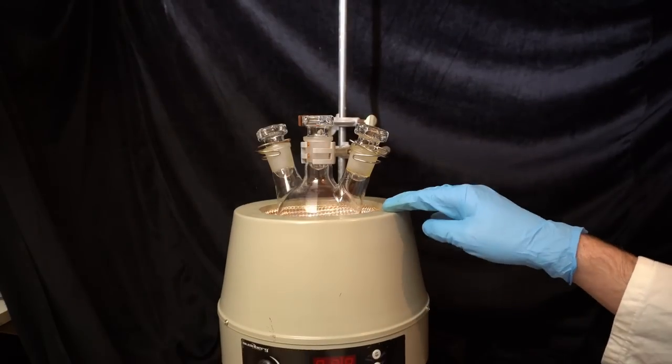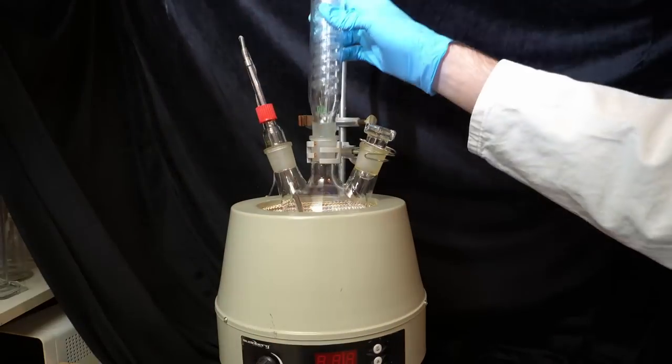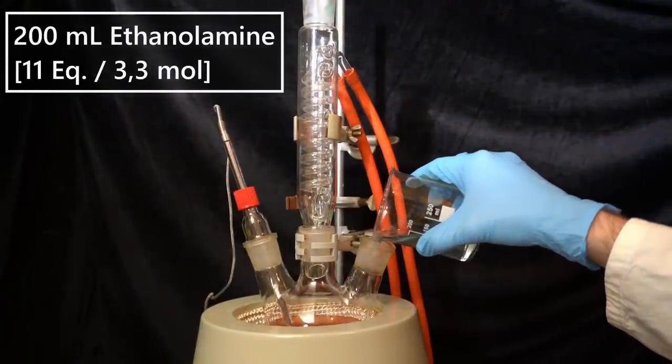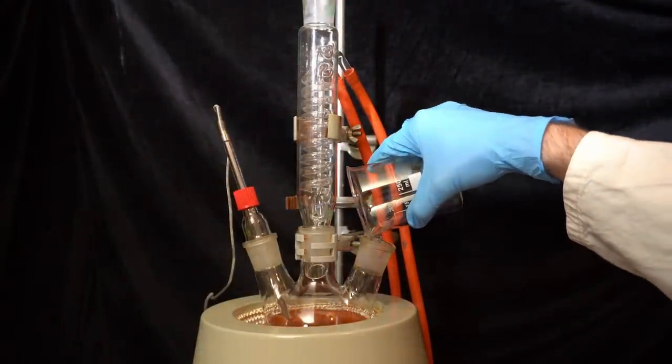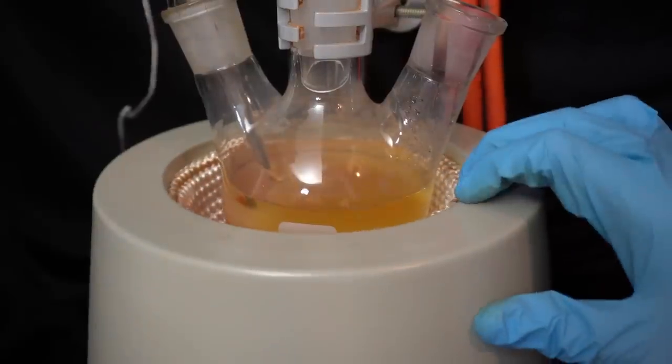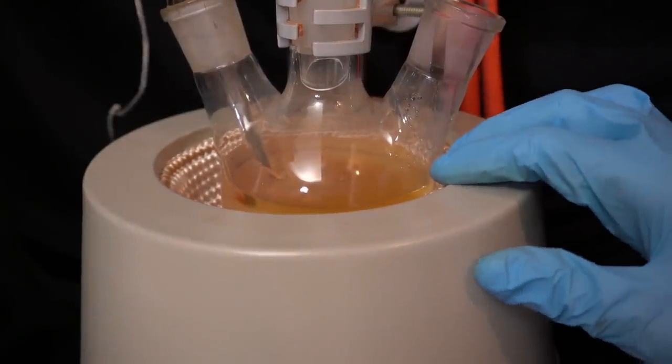I then install a reflux condenser and a heating mantle and add 200 milliliters of ethanolamine to the flask. The heat is then turned up to get the mixture to reflux temperature which for ethanolamine is at around 170°C.